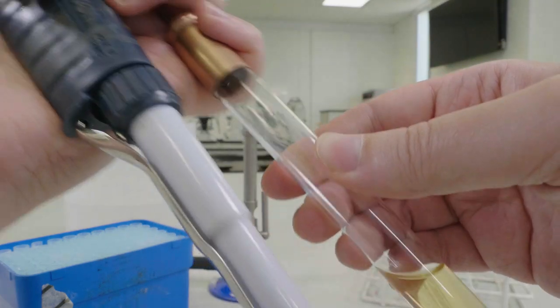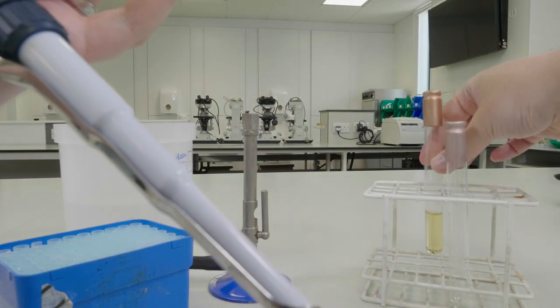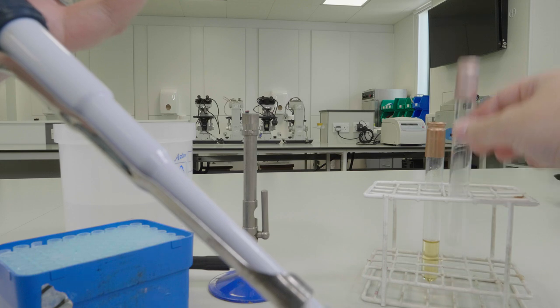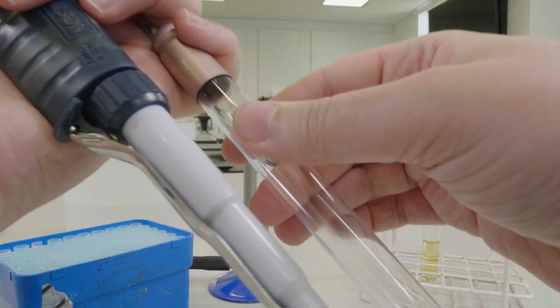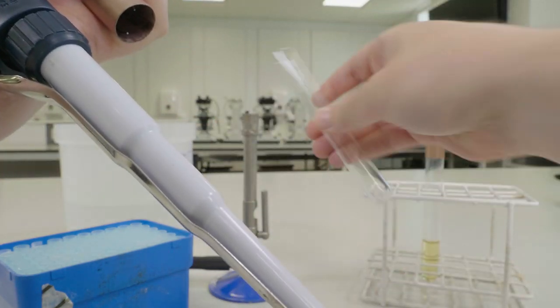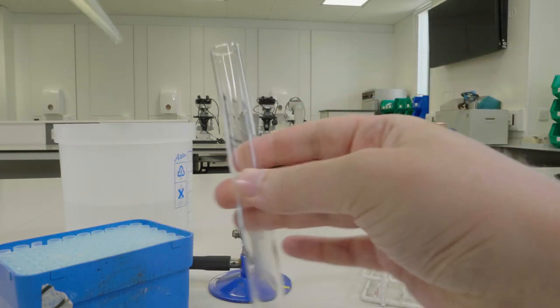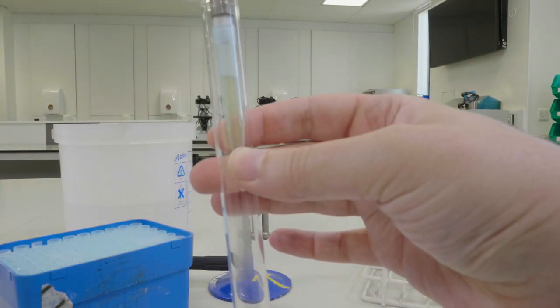Flame your tube, put the lid back on and place it back in the rack. Next take your empty sterile test tube, remove the lid using your little finger of your dominant hand, flame the neck and dispense the liquid into this tube.